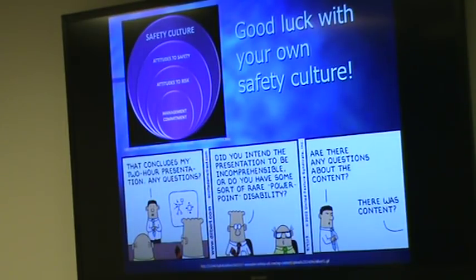Did you have? Yeah, so I know you said that the gloves should be the last piece to take off from PPE. No, the first piece. It's the last piece to put on, and the first piece to come off. And then you wash your hands. Then you take off the lab coats you're putting it in. Yeah, and if you're going to have the gloves off, then you pull from the inside.